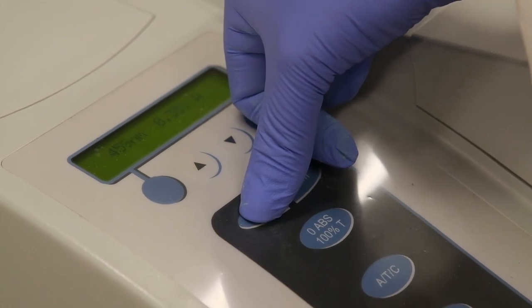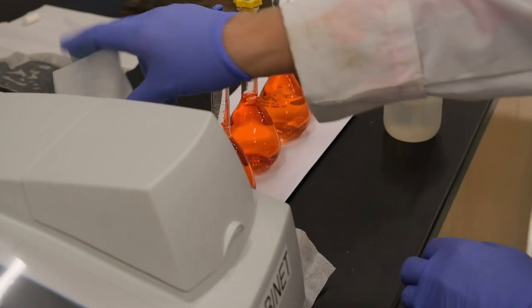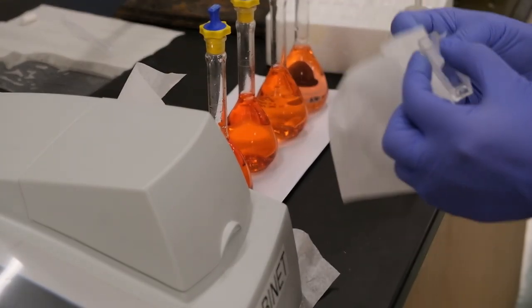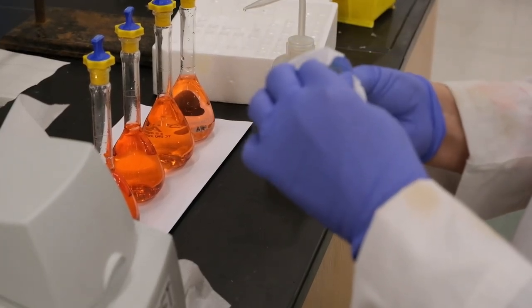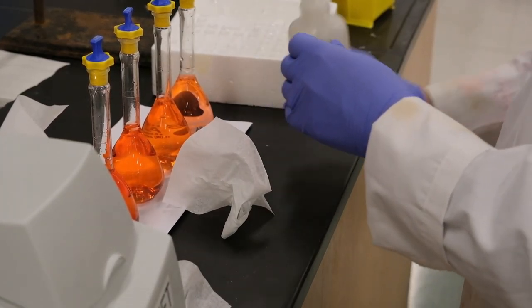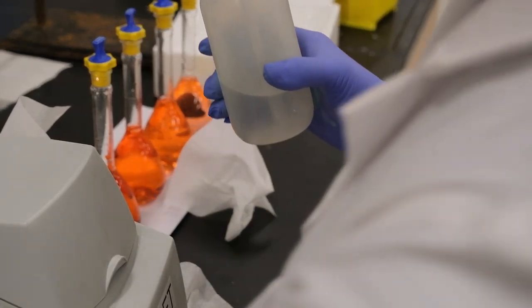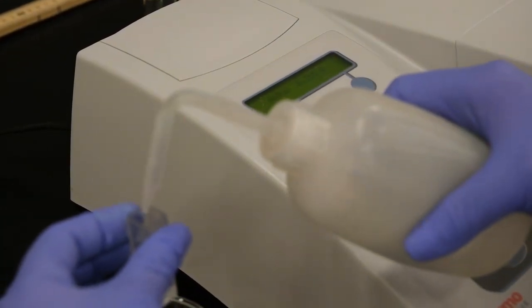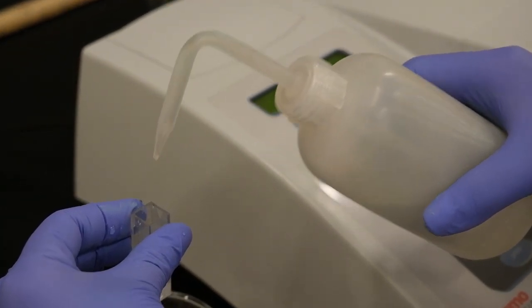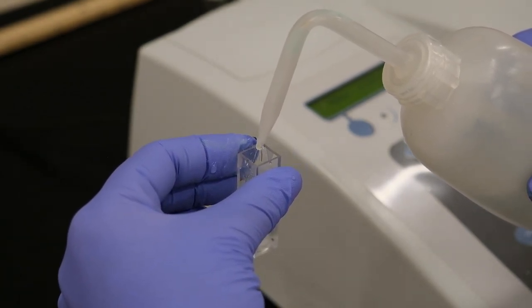Or up, in this case. And you fill up a cuvette with deionized water. So rinse it first, because somebody else might have used it. Rinse it a couple times with deionized water, and then you fill it up with the deionized water.